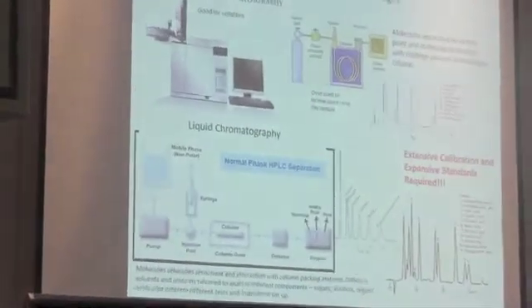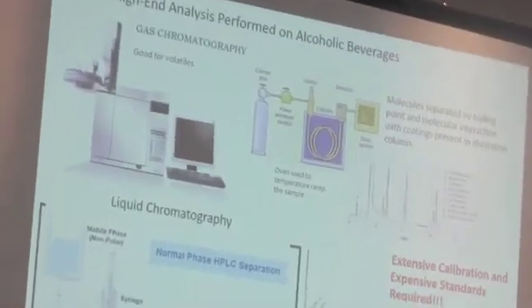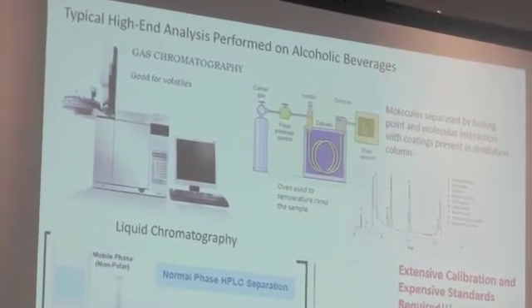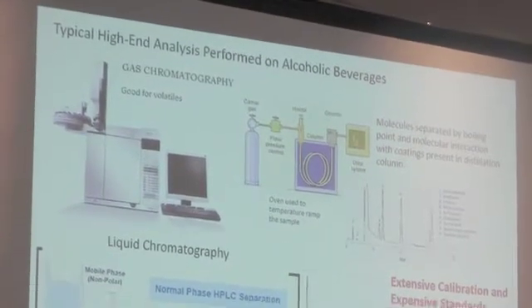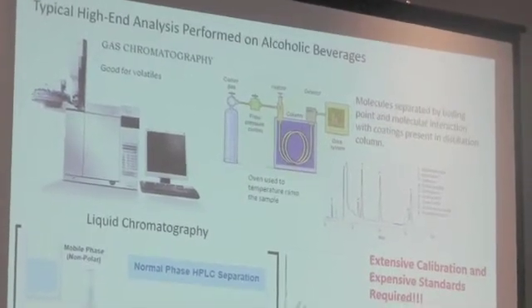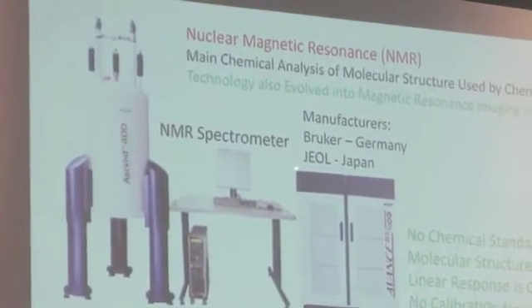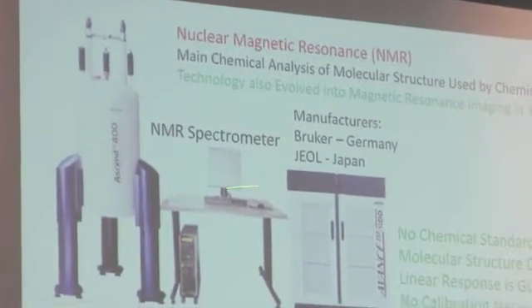But what you tend to have to do is send off for a test of some group of components of your cider. You don't just get a test that sees everything. You have to pay $200 for the sugars, $200 for the organic acids. Whereas what I do is you see everything all at once, there's no sample preparation or anything, you just put the sample in an NMR tube, shake it off and run it. And the machines tend to be very expensive, but like I said, you can get away with running it for next to nothing if you know what you're doing.